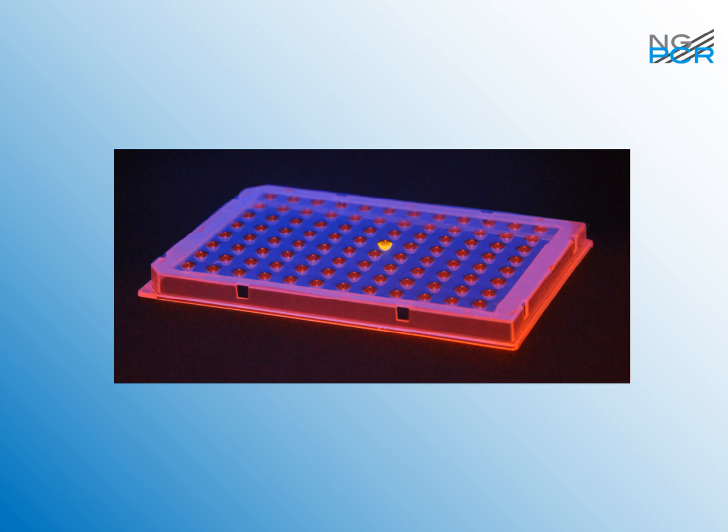And then here I show a plate which holds a fluorescently labeled sample in one of the wells, and which indicates towards where we want to go next year. So now we have the endpoint PCR cycler out, it's available, people are using it, they're getting good results. But we want to come with a qPCR machine next year, which can do qPCR in a matter of, well, minutes also.